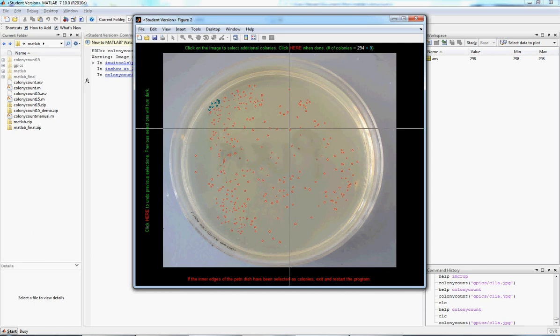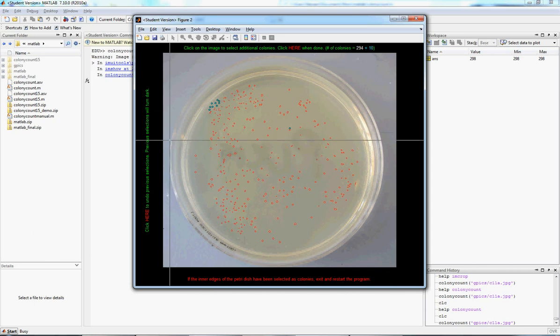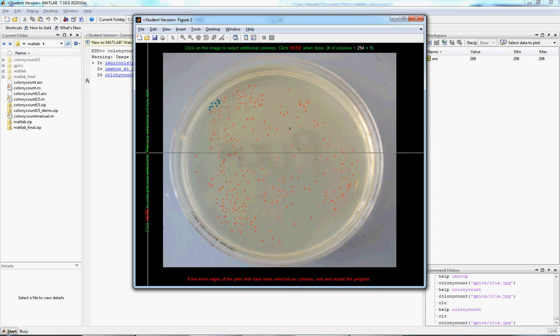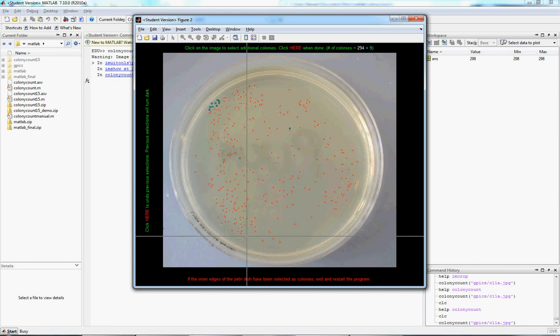If we make a mistake, like I accidentally just did that and that's not really a colony, I can undo it here and it fades to black. So if there's a couple more over here, add those.